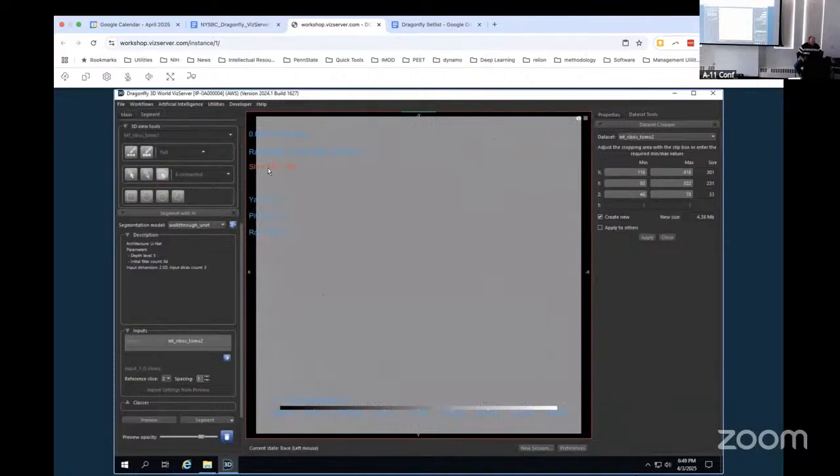My box disappeared. I'm not sure what happened to it. Maybe it's not 7. Why is it at 110? This is very weird. That box is in the wrong place entirely.